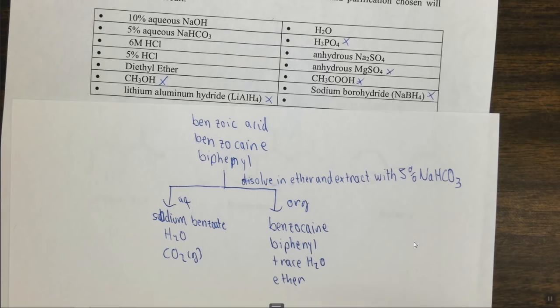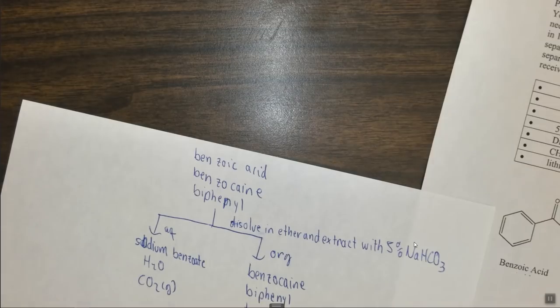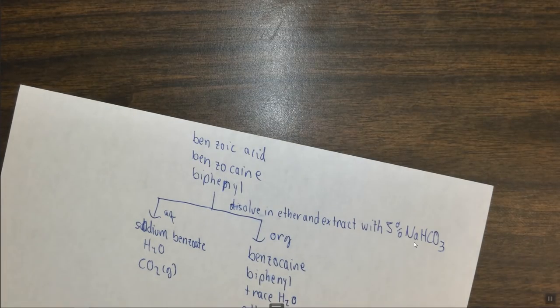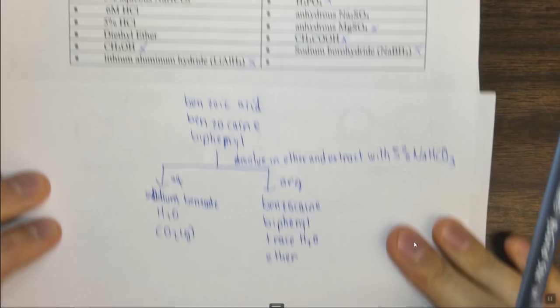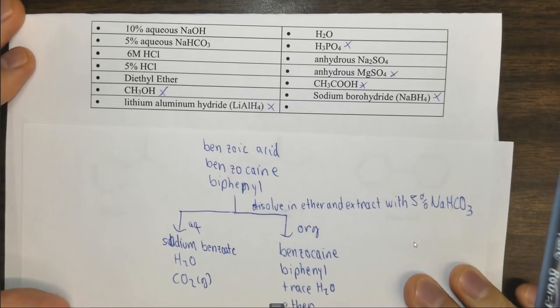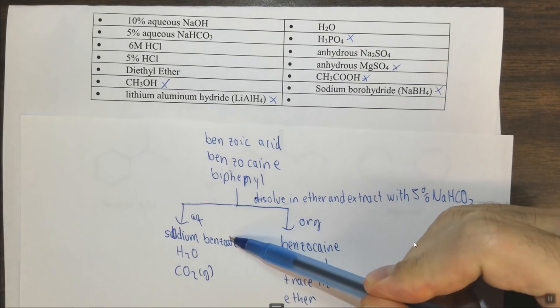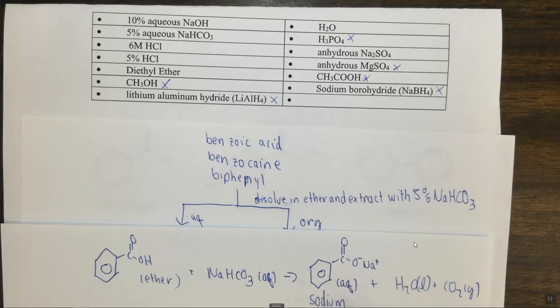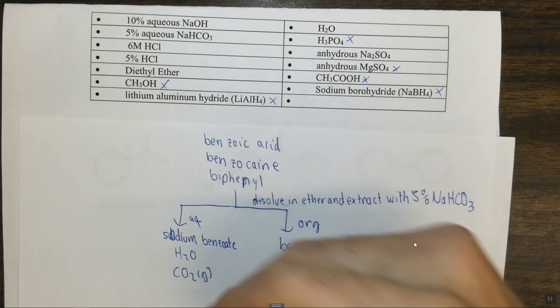Now what do you want to do? Well, I want to focus on isolating my sodium benzoate. So I'm going to hold this, so hopefully we can see everything on the screen at the same time. Nope, we can't. All right, so I'm going to have to move this back on and off the screen. If I want to get my sodium benzoate back, and I have this molecule in the aqueous layer, how am I going to get this back? I need to add an acid and reprotonate it.